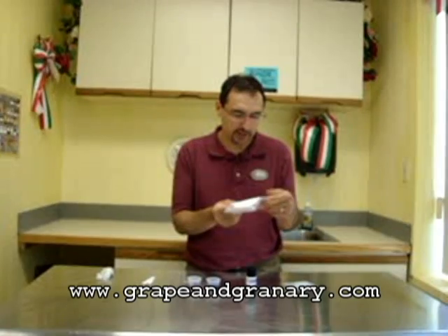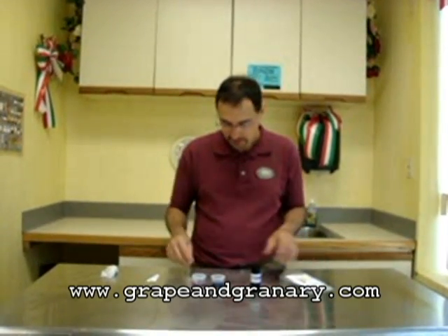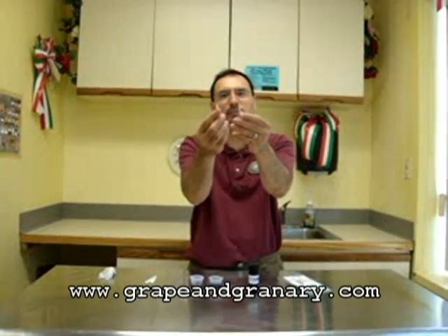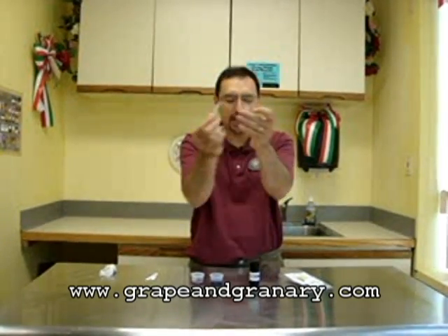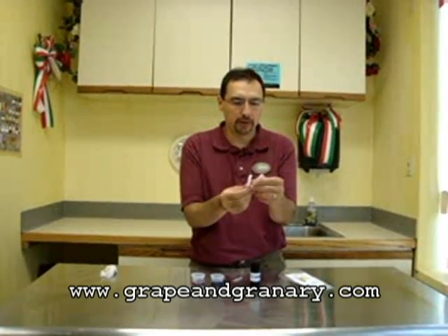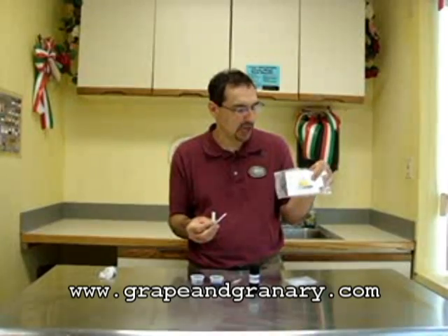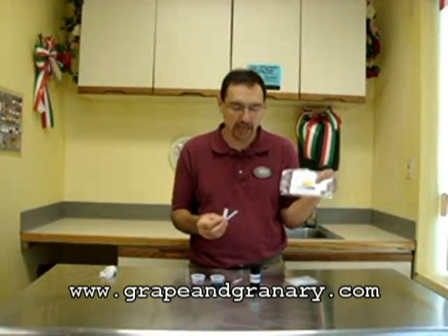What I've got here is an Acuvin malic acid test kit, and the way that we're going to run the test is we have a couple small aspirator bulbs that will allow us to suck up a couple samples, and we'll put those on a small test strip, and we'll compare the color of the test strip with our package that will tell us how much malic acid is in our sample.